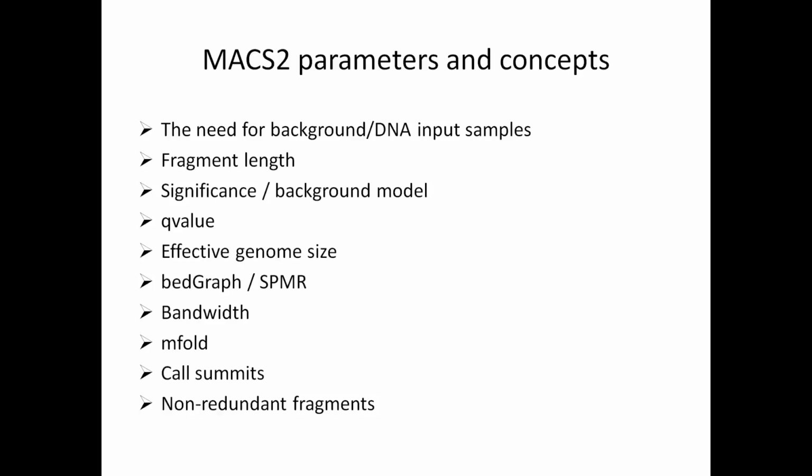So lastly, I'm just going to mention the concept of non-redundant reads in MACS2. The peak caller uses non-redundant and extended reads, which makes a fragment. Reads are removed that share the same strand and 5' end position by default, only leaving one example. This aids in removing artifacts caused by the sequence, for example regions that cause PCR overamplification during the library preparation step.